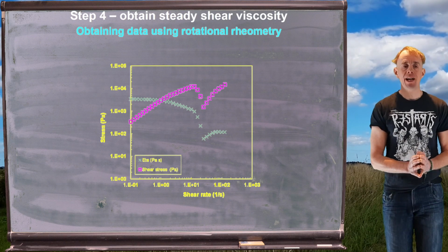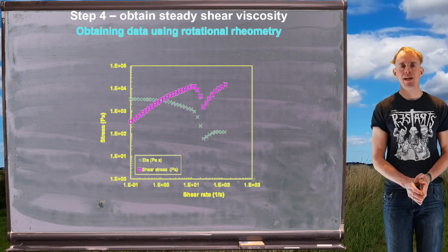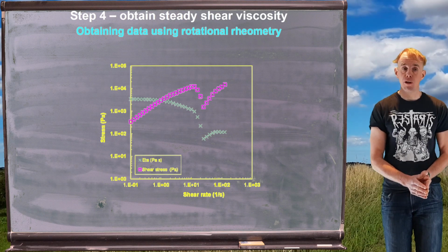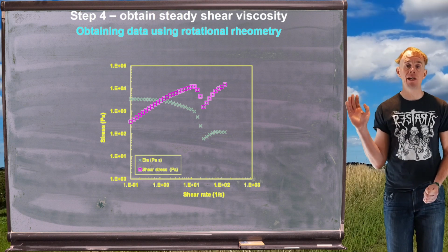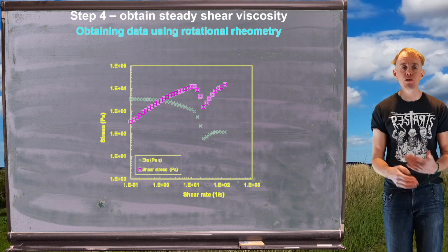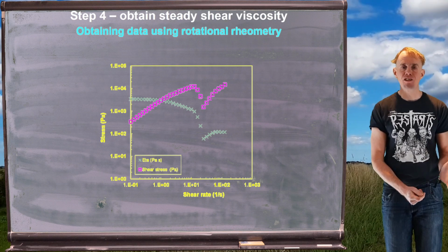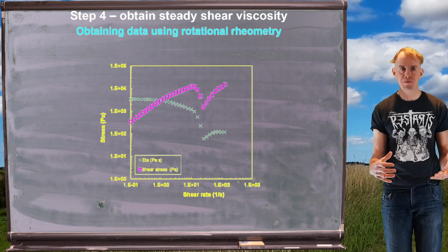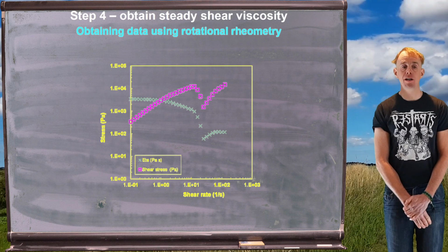Well, what we have here is a polymer being deformed, contained between two parallel plates. If one imagines the normal forces that are set up, the normal forces are persuading this polymer to exit our experimental system. And so what we actually see here are the effects of varying degrees of decreasing containment for our polymer. At low steady shear rates, you've got good contact between the plates and good experimental data. At increasing shear rates, the polymer is squeezing out of the plates, it's starting to leave the system, and the measurements that you're getting are becoming less and less reliable.